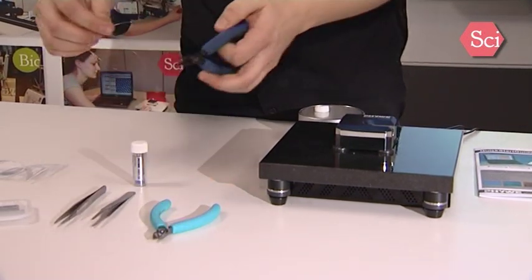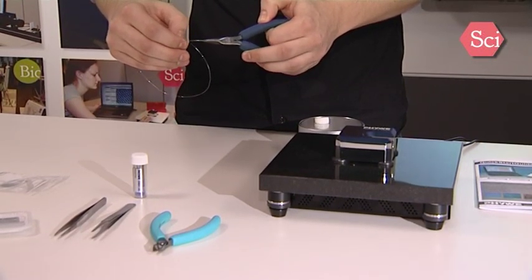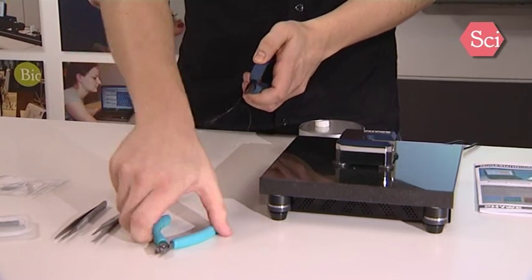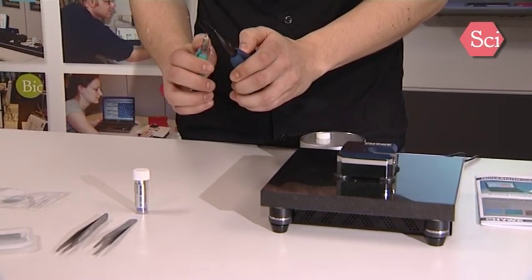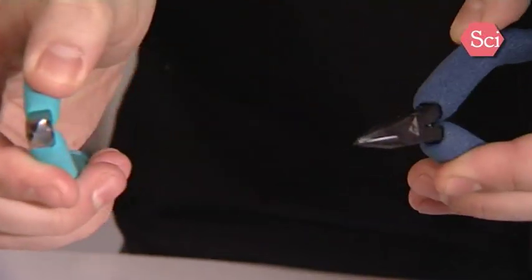Just take the flat tool to hold the tip and the wire cutter to cut a fresh tip. Use a very sharp angle between the tools to get a very sharp tip. You have now prepared a new measurement tip.